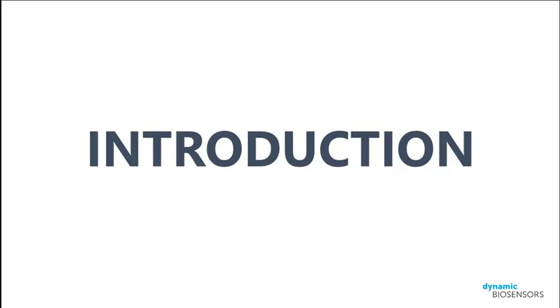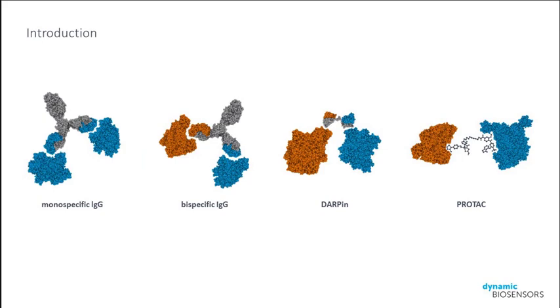I look forward to demonstrating our workflows for assaying bispecific binders. The most prominent example is traditional IgGs, including bispecific and multivalent formats, and more recently, constructs that link two binding modules such as DARPins. In addition to large macromolecules, we can also work with smaller molecules such as PROTACs that have been developed for proximity-induced drug development.